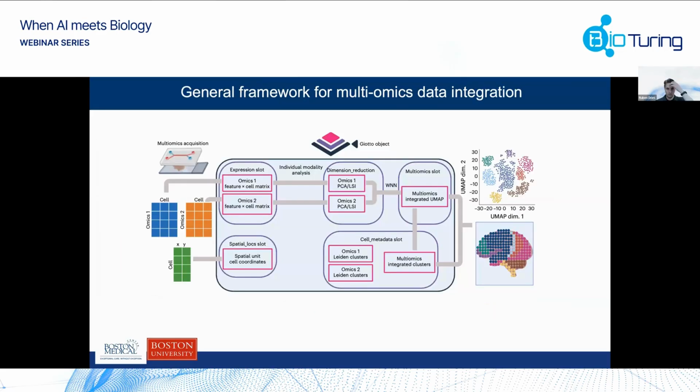All right. We talked mostly about multimodal data. If you have multimodal data, you can sometimes also have what people call multiomics data on the same tissue. Then we also have a very flexible way of combining this information, by combining the underlying networks in whatever dimension reduction space you would like. A very popular one is the weighted nearest neighbor approach, which I think was originally developed by the Satija lab. But you can really do this with whatever weights you come up with. And I think there are a lot of new tools that think about different ways to weight and combine these networks.